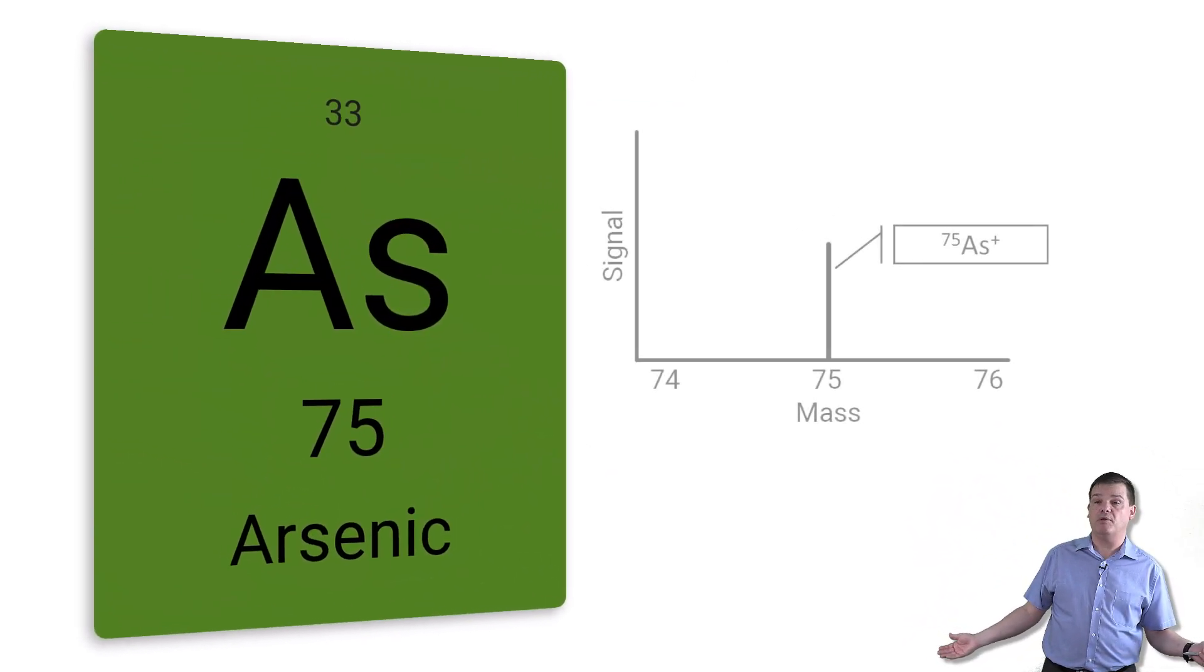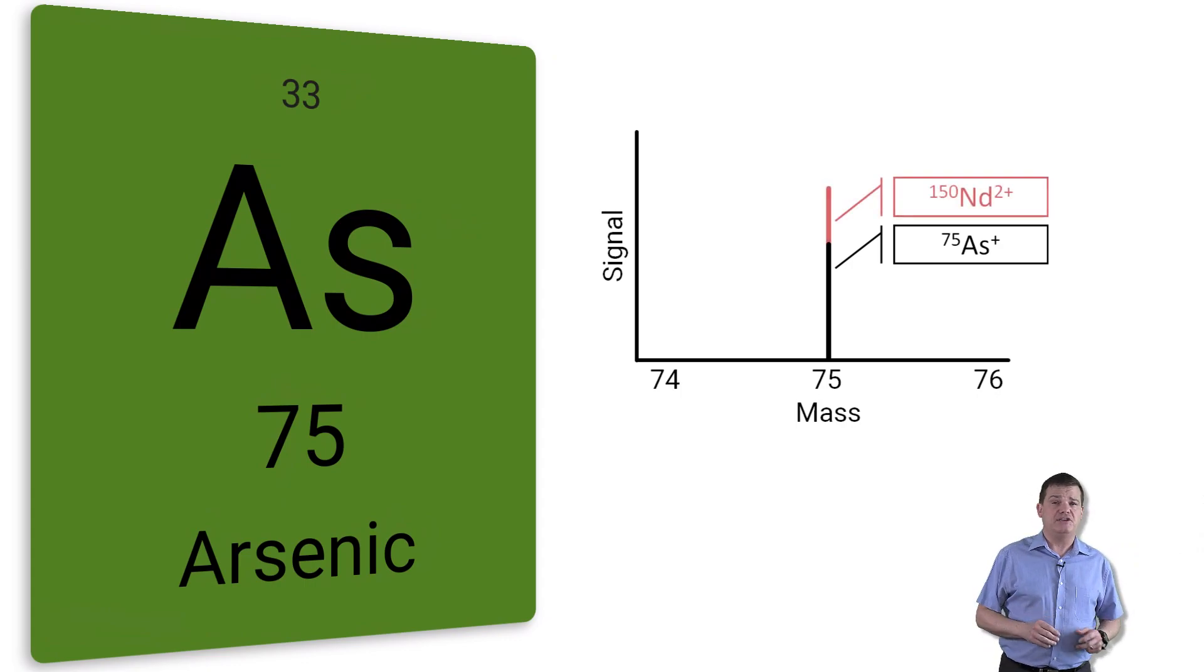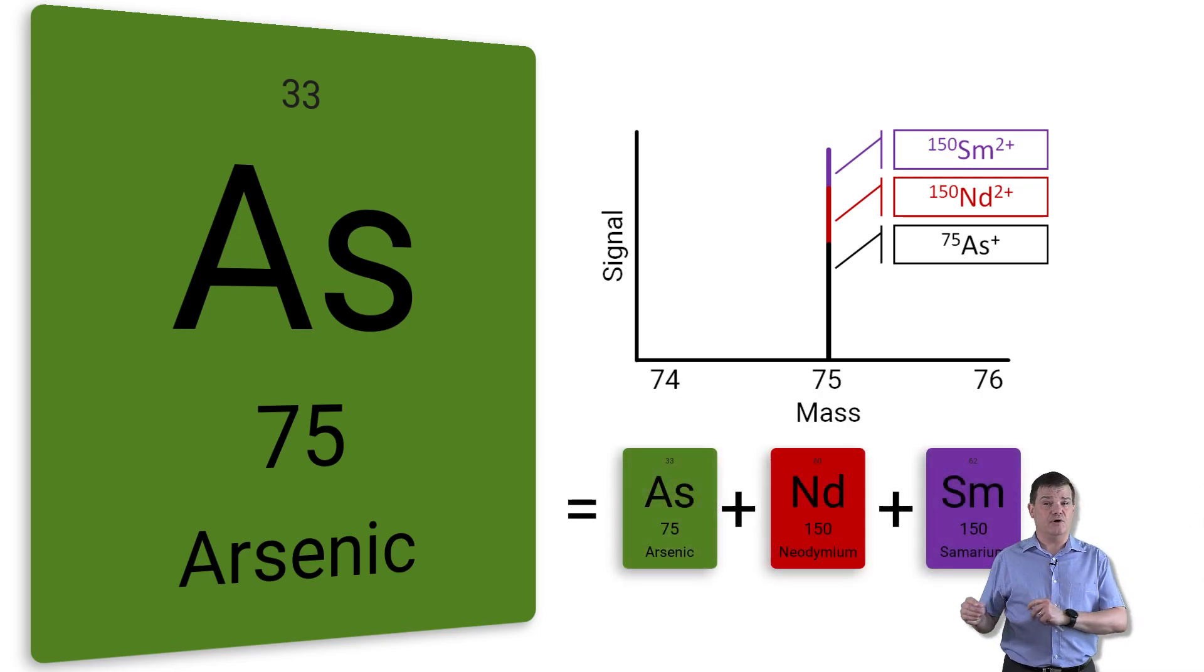This is a problem because the signal from the doubly charged neodymium and samarium will contribute to the signal we measure for arsenic at mass 75, giving us an overestimation of the arsenic concentration. So let's take a look at how we can rid ourselves of these pesky doubly charged interferences.